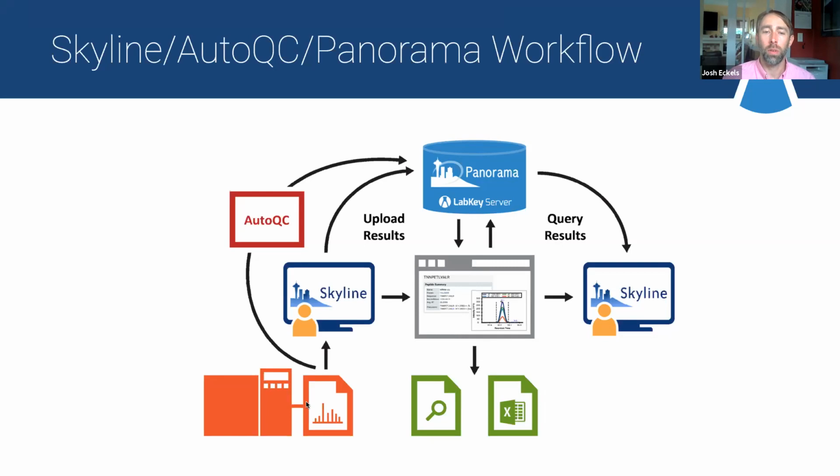And then what we want ultimately, to make this faster and more automated, is to have this bypass lane here. So instead of having someone needing to import that new sample that was just acquired into your Skyline file, having AutoQC that Lindsay talked about, that automated program that's just watching for those files to be acquired, automatically analyzing them based on the targets that you've set up in your Skyline document, importing into Panorama, sending out email notifications, and letting you know everything's fine or everything's not fine.